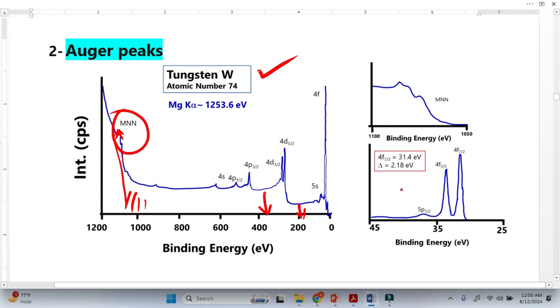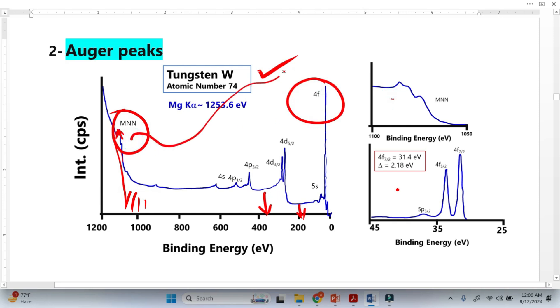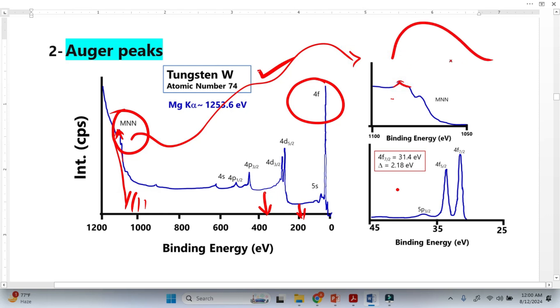Look here — these are the high-resolution spectra from the 4F peak, and this is the high resolution taken from this Auger peak here. We can see that the peaks are not sharp peaks; they are just like a hump. So this is another identification of Auger peaks.